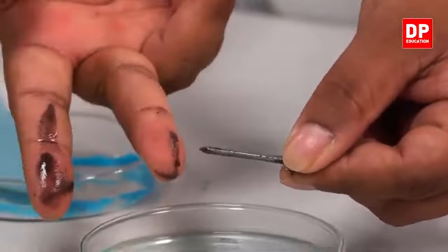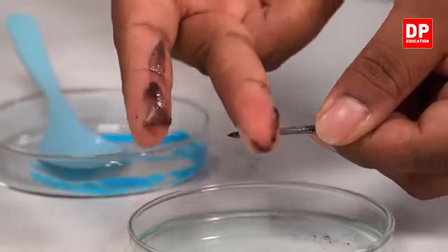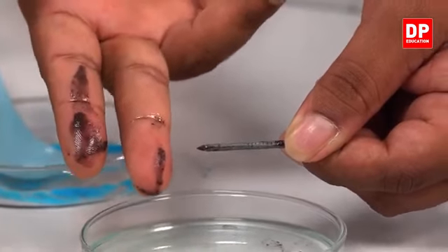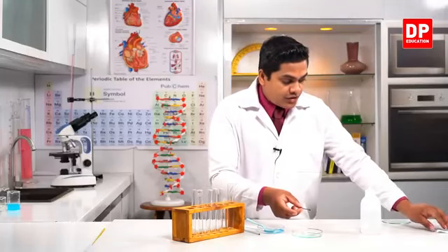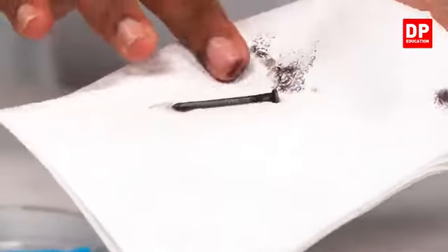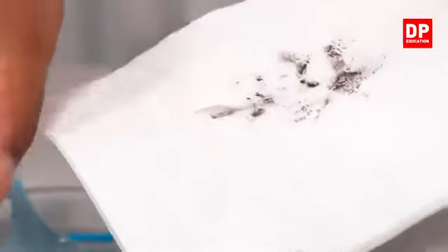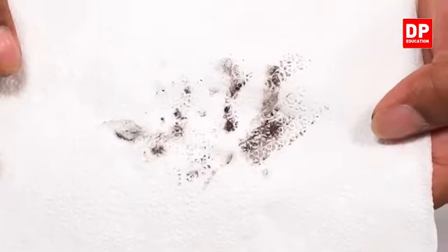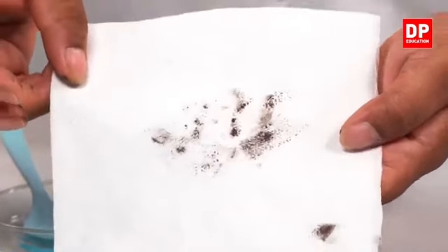Now you can observe the shiny iron nail within this brown color powder. It's a brown color powder. Right? I'm going to use a tissue and I'll show you this powder. So it has a brown color. It has a brown color stain. Right? So this powder is copper.